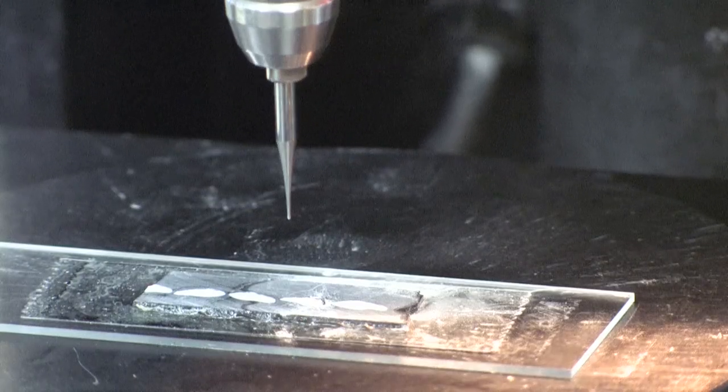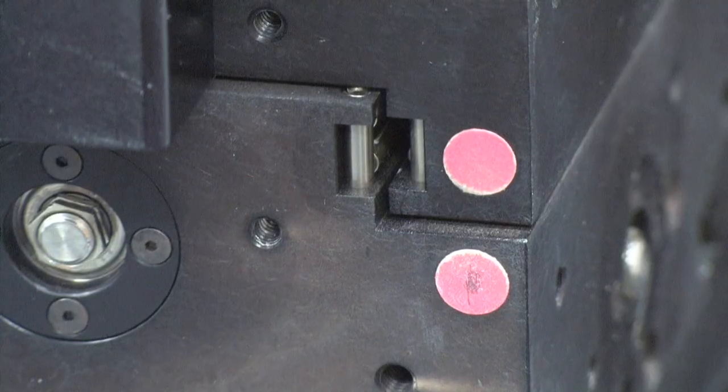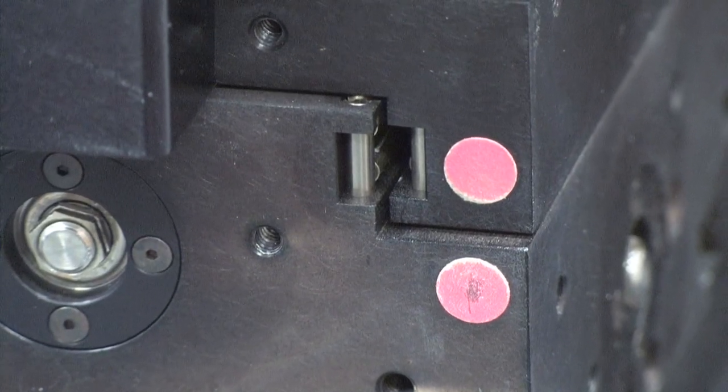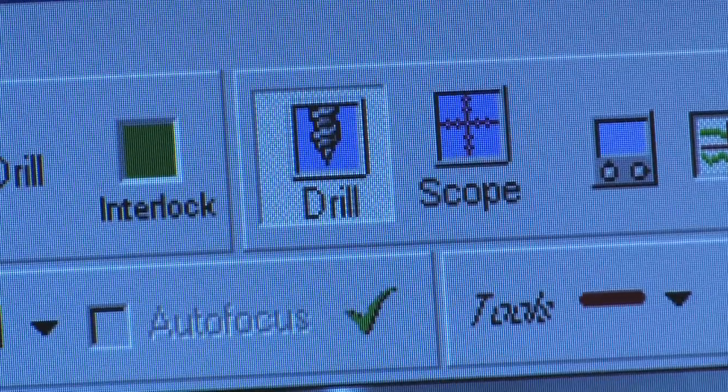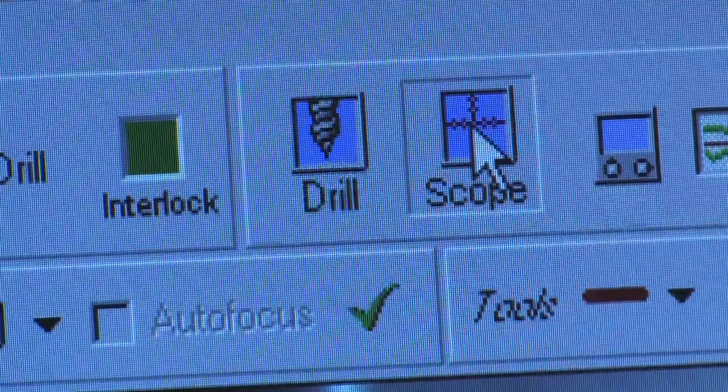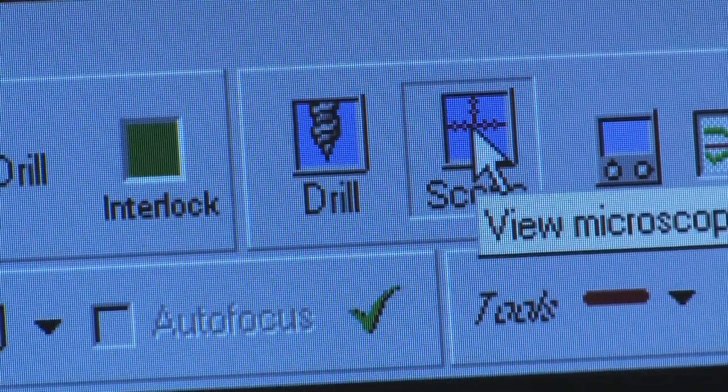If the drill does not drill in the area you want it to, the X-Y offset is out of alignment and will need to be readjusted. If switching from the drill camera to the scope camera and the video screen stays on the drill camera with the colorful line, hit the scope camera button again.